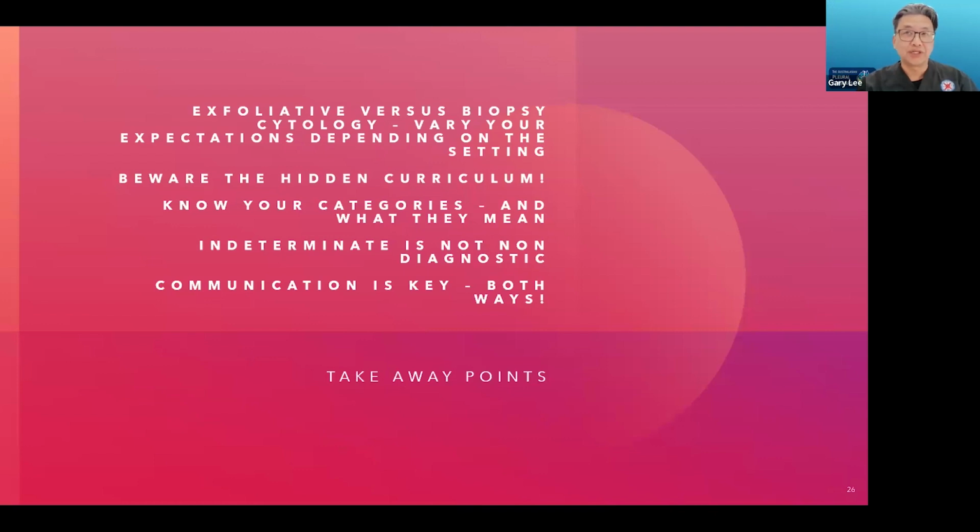Sure. Another 2 questions, all about processing. Does it make a big difference if we use those preservative bottles or add heparin to the cytology samples, or should we send it fresh? And alongside that, how quickly does it need to go to the lab before it degrades?